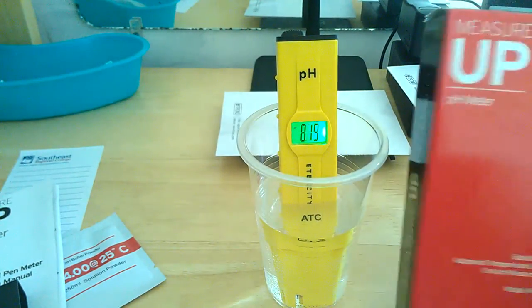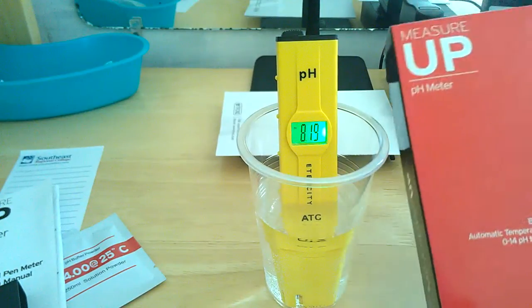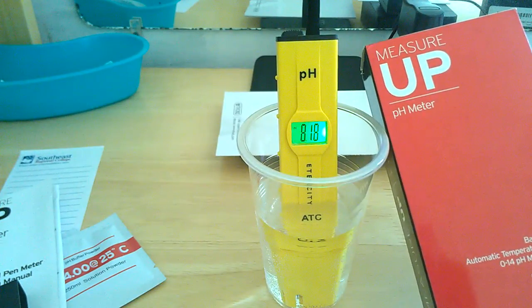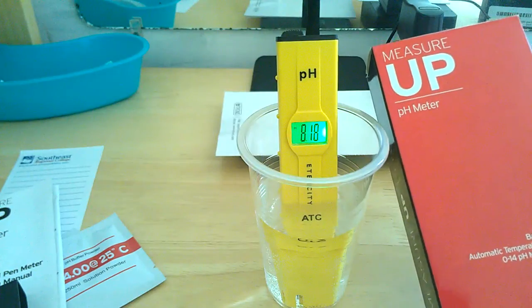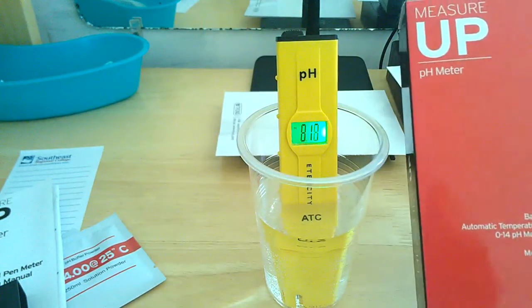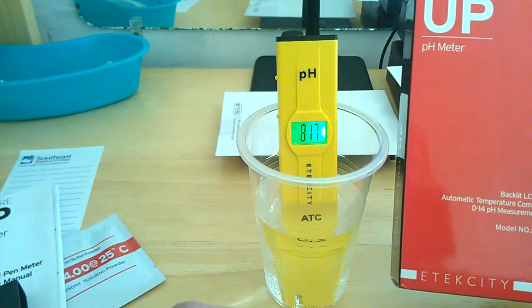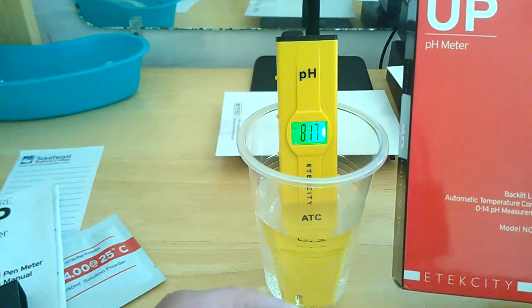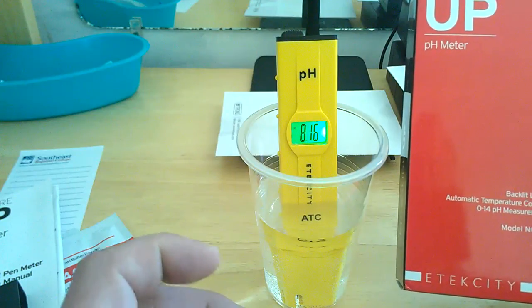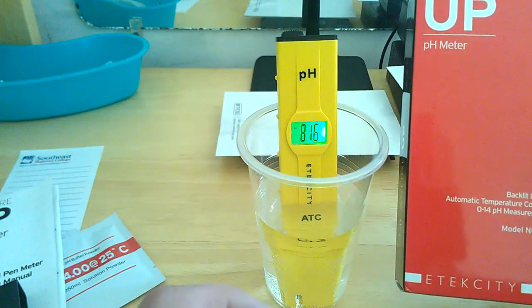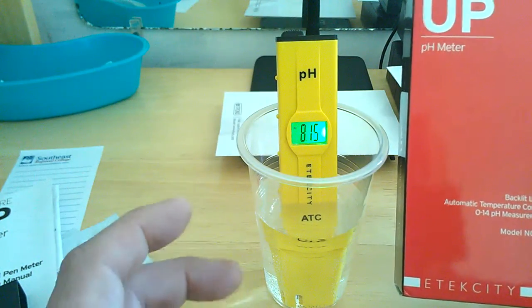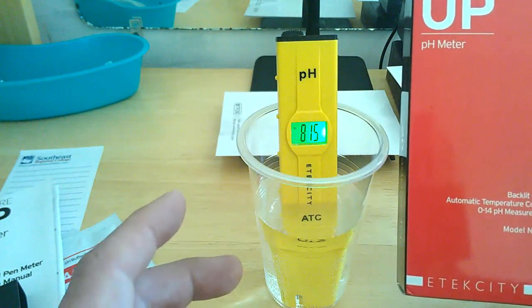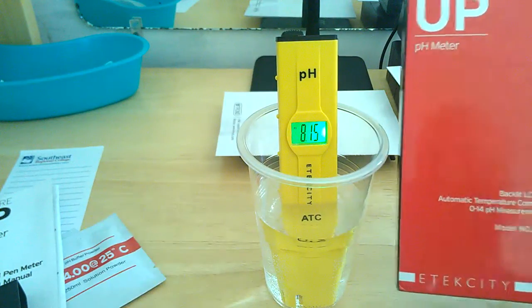This is Reviews4Us guys. Like I said, if you're testing products like fluids that need a more precise reading, you use those buffer powders to achieve that. If you can use it in a lab, it's great for anybody who wants to test their water, their beverages, anything like that. Fish tanks for aquariums and stuff like that. If you have to keep your alkalinity level and your pH balance just right in your fish tanks. Swimming pools, absolutely excellent for that.